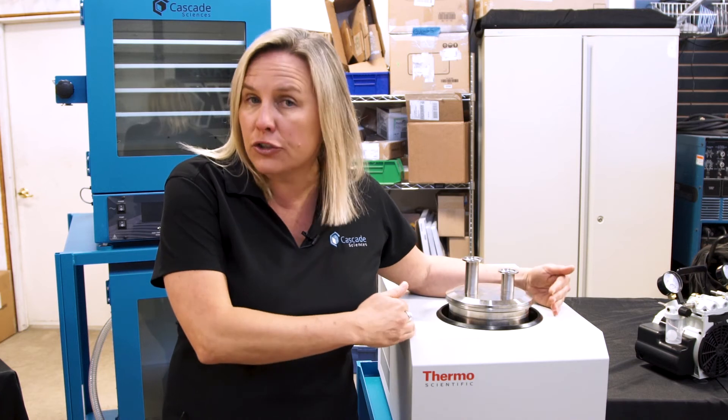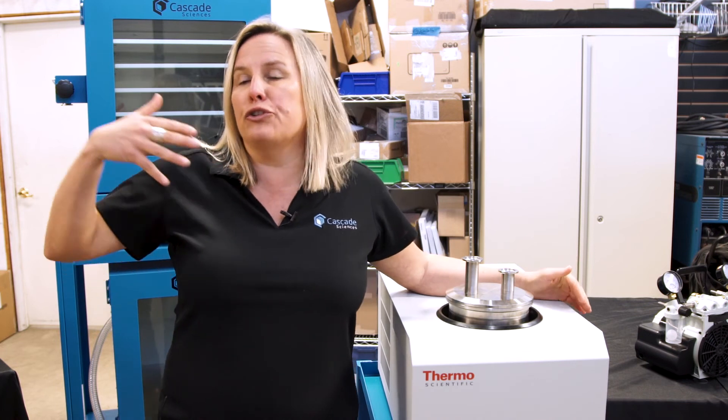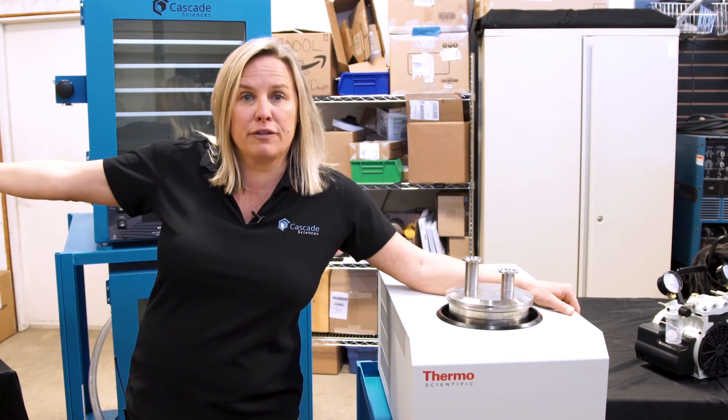That would be my tip for using a cold trap for exclusively terpene preservation. Do it on the front end of an extraction, not when you're trying to liberate solvents and preserve terpenes at the final finish.